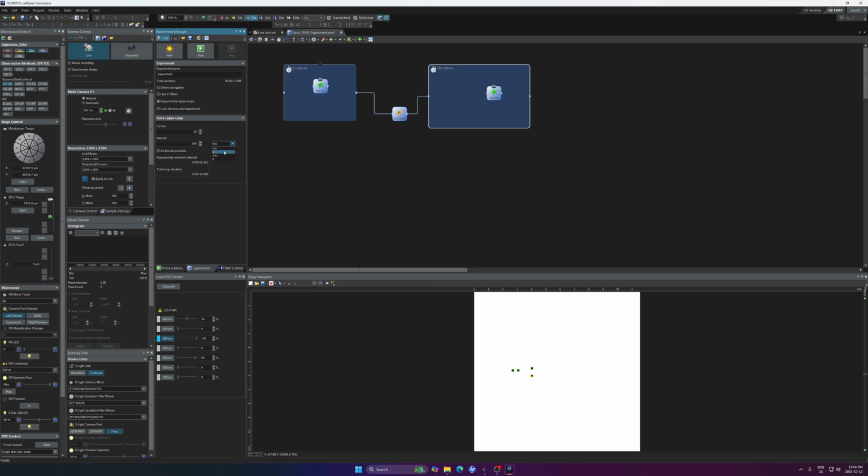No, let's do every second. And that's enough. And there's no apply setting here. So it's very important you modify the FRAP parameter by activating this button. Otherwise it would not take it. And I'm going to take this to 488.